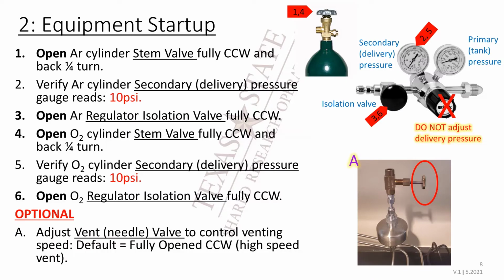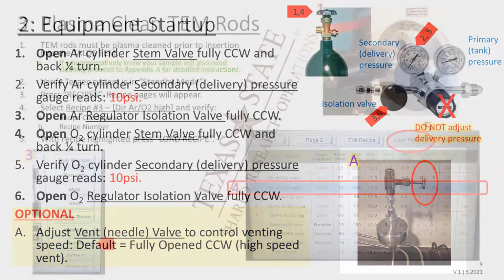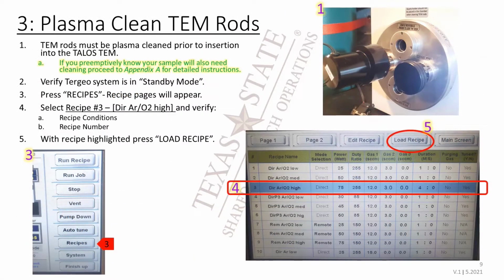As an optional step, you can adjust your vent needle valve to control the venting speed. Default is fully opened counterclockwise. TEM rods must be plasma cleaned prior to insertion into the Talos TEM. Verify that the Tergeo system is in a standby state.